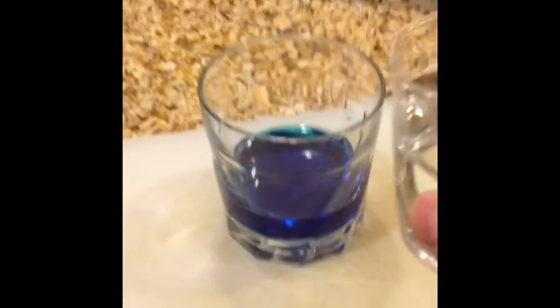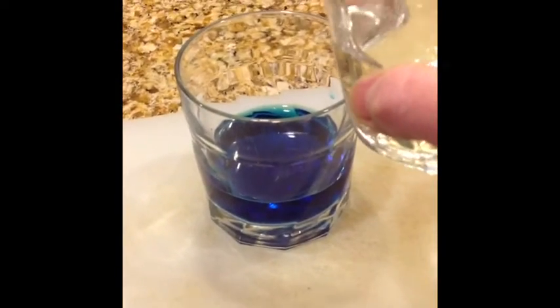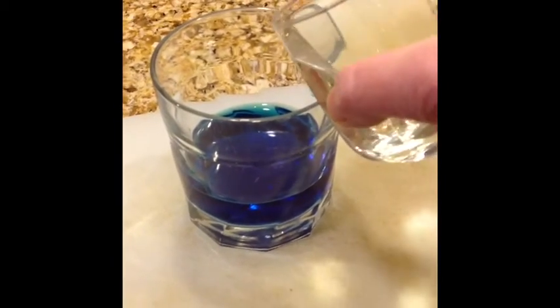Next chemical reactions are a change of color. If we have a change of color, a chemical reaction has occurred. So here you see a blue substance and a white substance, or clear actually. If we take this clear substance and pour it into the blue substance, you would think it would just be maybe diluted blue.